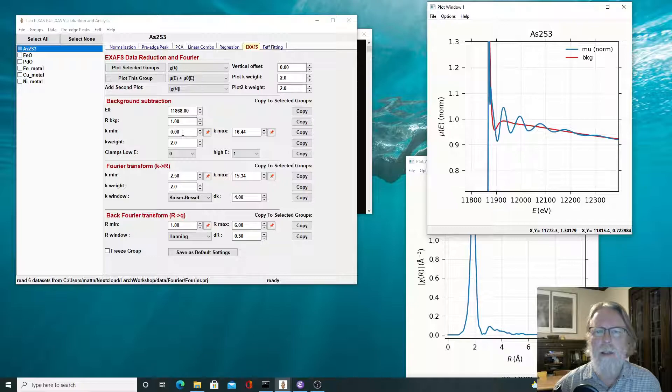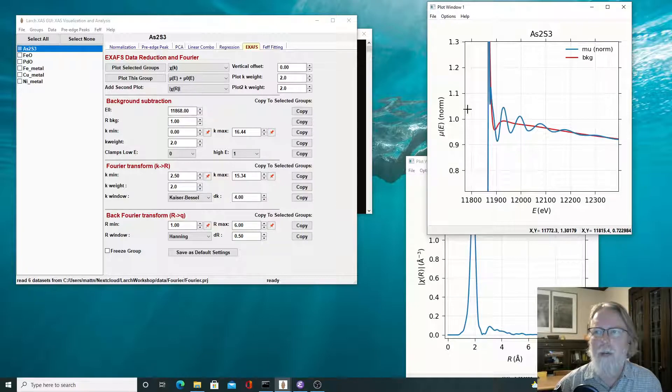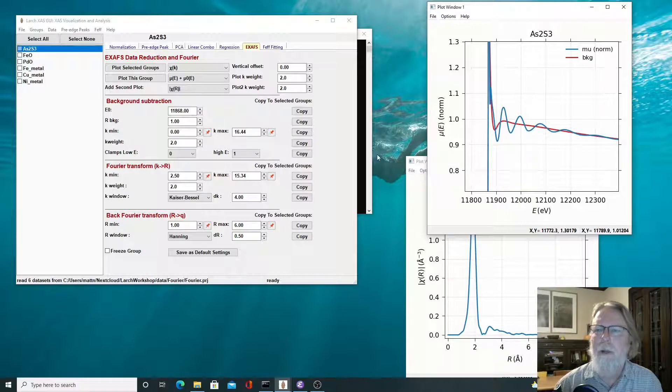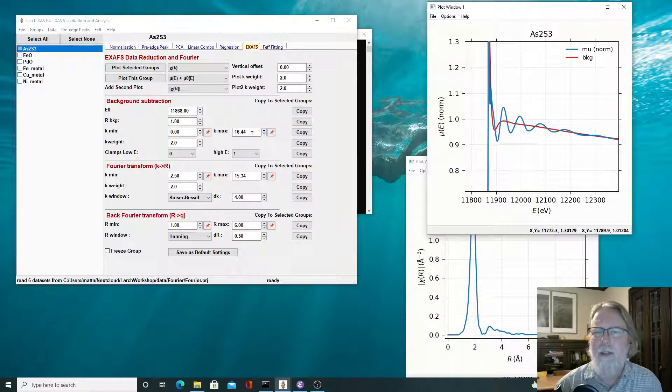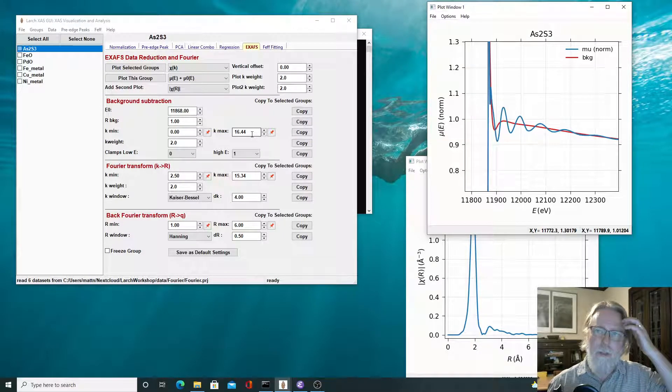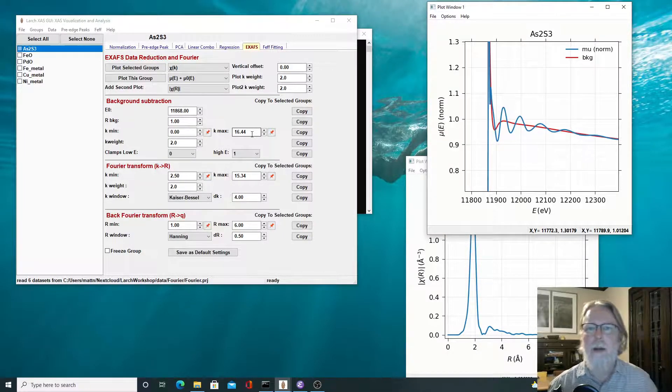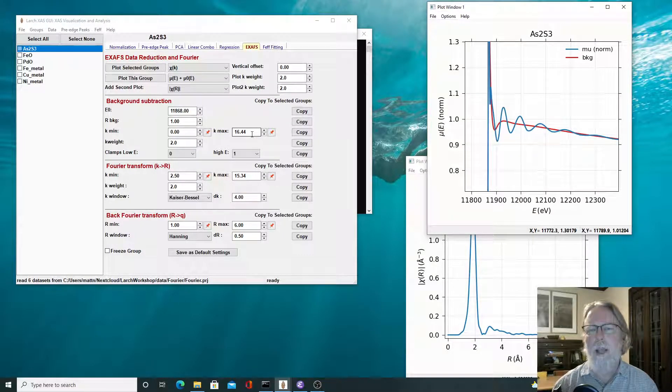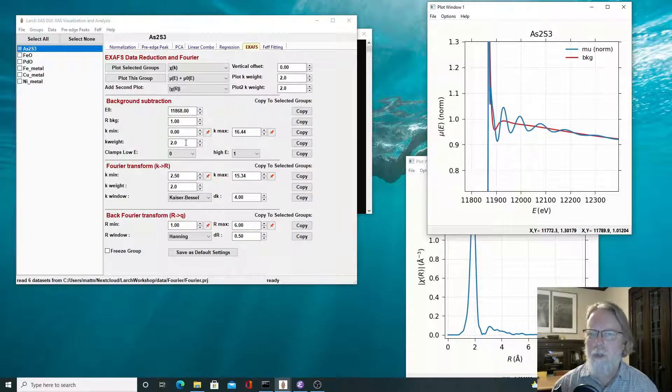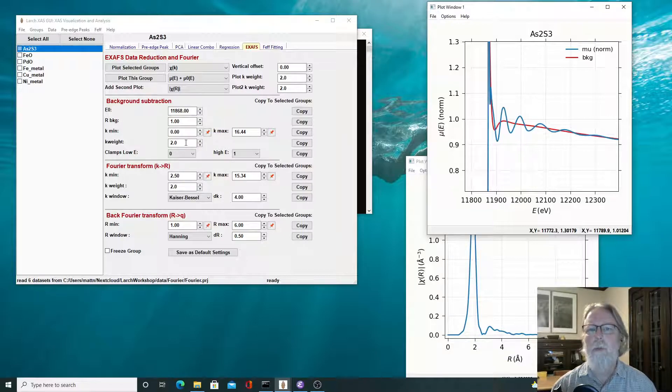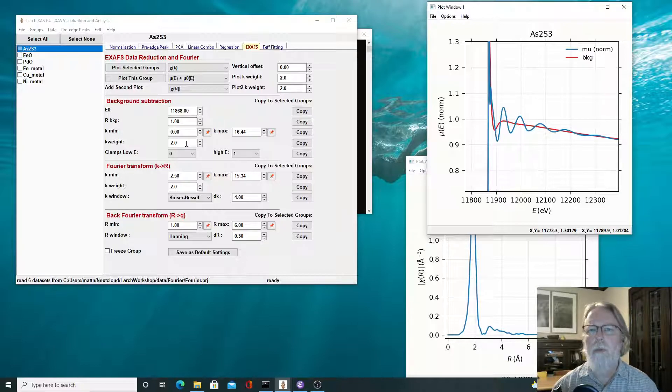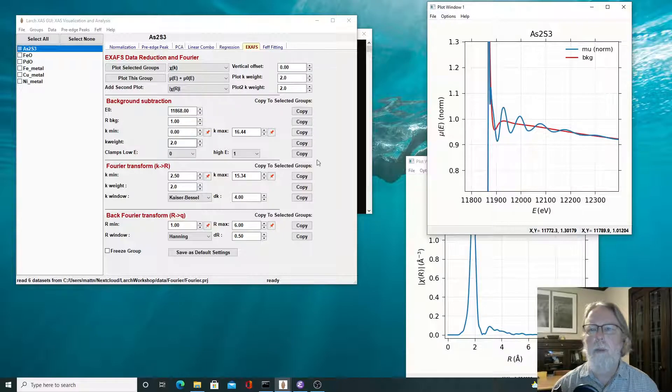So this Fourier transform is not necessarily the same Fourier transform you'd want to do for an analysis. We start at K of zero, for example, so that we can try to get as much down to as low as K as possible. We usually end just right at the end of the data range, or if there's data that is bad because of glitches, we'll often stop there. And a K weight value is typically one or two instead of two or three. We want to make sure that we emphasize the low K values when we do that Fourier transform.